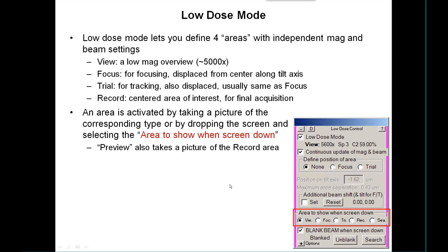There is also a fifth camera parameter set called preview. This one activates record but does it with the binning and exposure time of the preview, so it lets you see the record area with a very low dose.